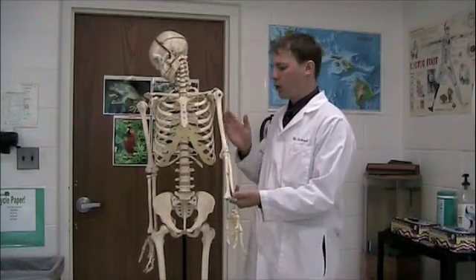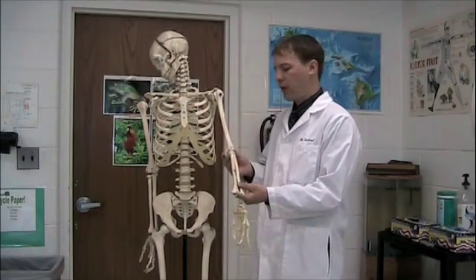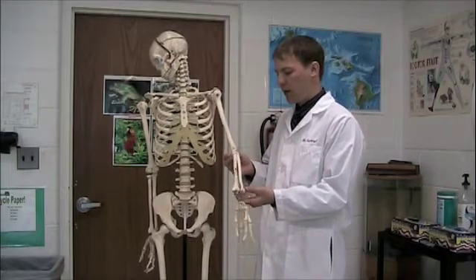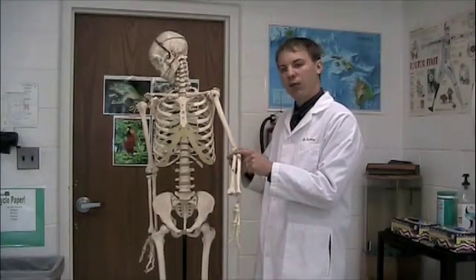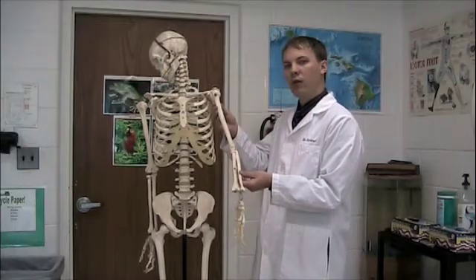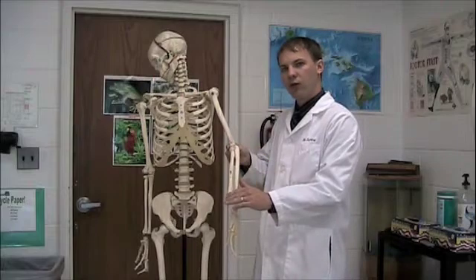Now take a look at the arm bones of the human as compared to the rat. Extending from the shoulder down to the elbow we have the humerus, and then two bones extend from the elbow to the wrist: the ulna, which is the slightly longer one that connects at the elbow, and the radius, which is the smaller bone extending from just below the elbow down to the wrist.